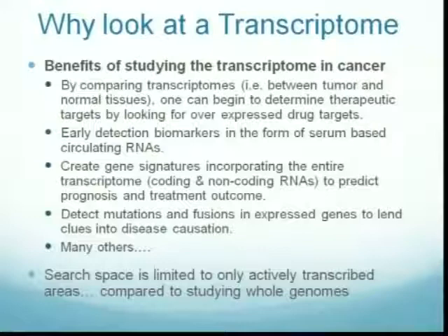And one of the other positive benefits with doing transcriptome versus whole genome is that your search space, where you are looking in the genome, is limited only to those areas that are transcribed, instead of looking at the entire 3.2 billion letter long genome. Any questions? Okay, great.